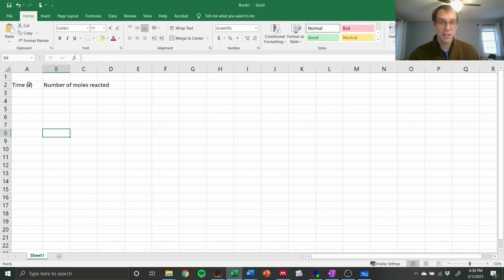You'll be doing this for 3 sets of data at the same time, but I'll show you how to do it with one. You can basically copy a very similar process using the outline that's in the lab write-up to do the other sets. So your first column will be experiment 1. And you'll need to put the cumulative times for the reactions there. So start with 0, and I've got some dummy data here that I came up with on my own. This is not real data, but will give us something that we can work with. So don't use these numbers is what I'm saying. Look at the numbers that are actually in your lab write-up.